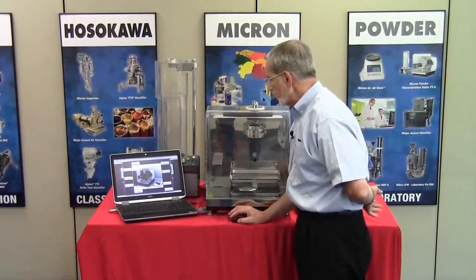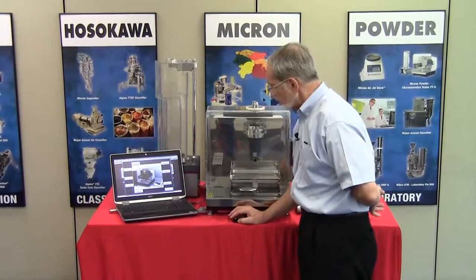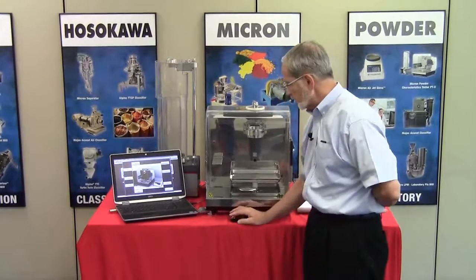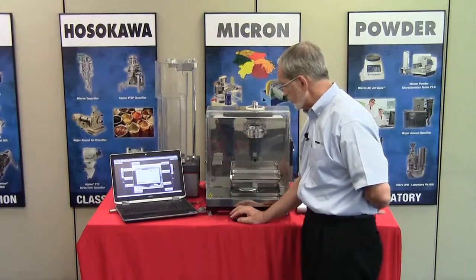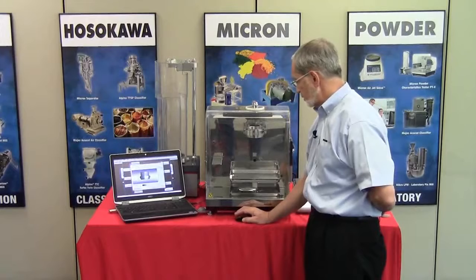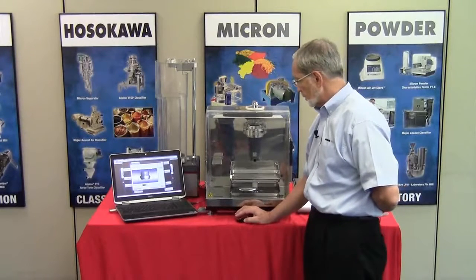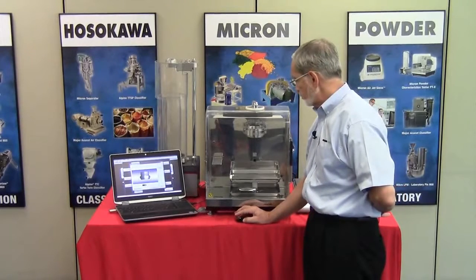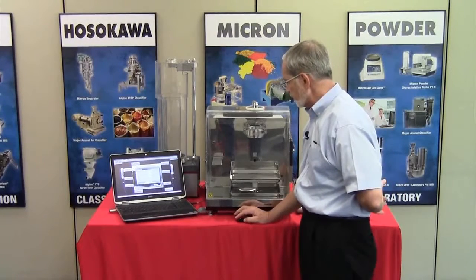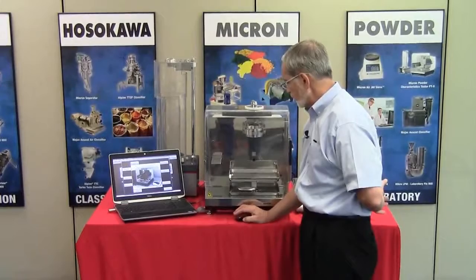This particular component is an optional component that's applied independently. Vibration: we can actually vibrate this, and I've got a little tool in here just to give you an idea, because it's going to vibrate. As you can hear, it gets rather noisy, so we'll just stop it midstream just to confirm that the vibration is working.